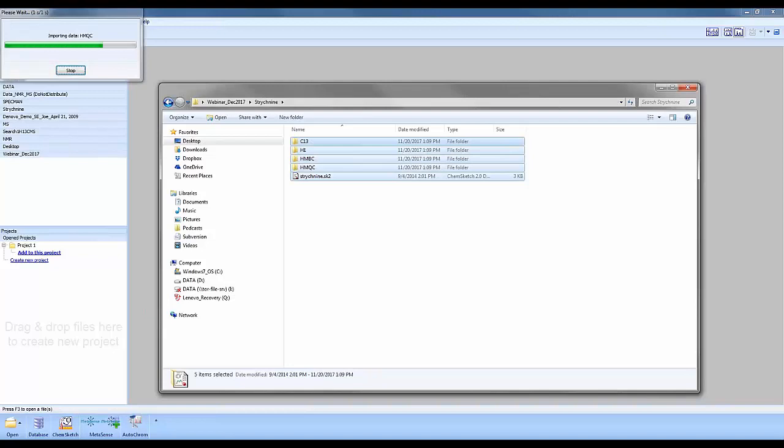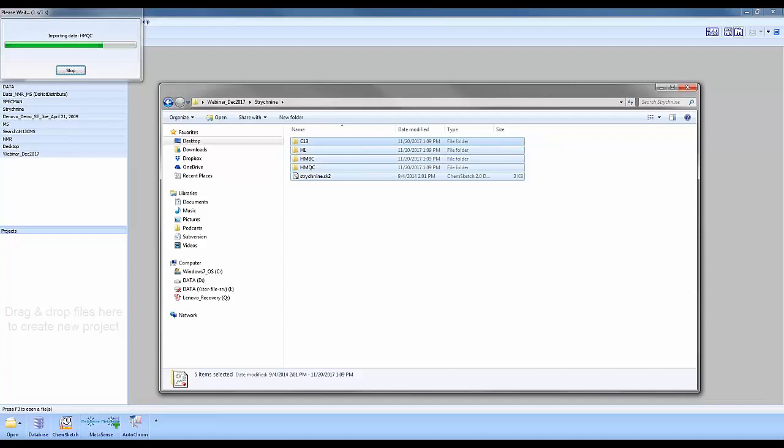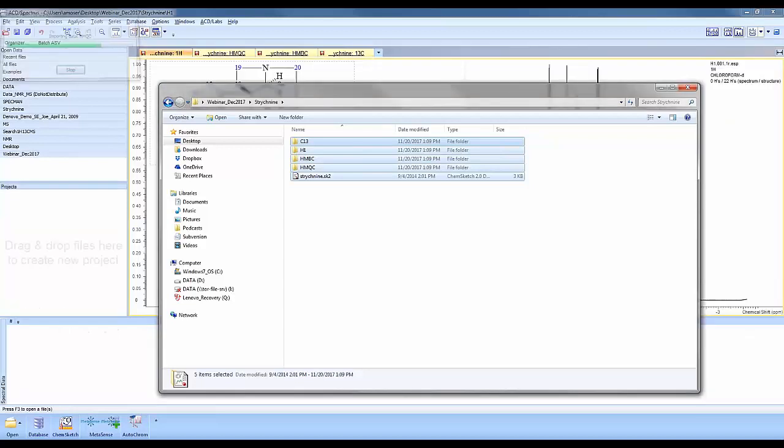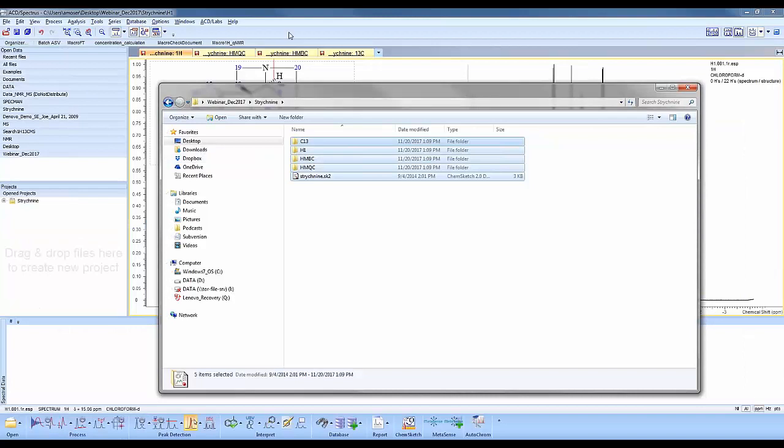This will import the data, check alignment, and check for any solvents and identify that for you automatically. It'll also attach the 1D NMR experiments to the 2D.